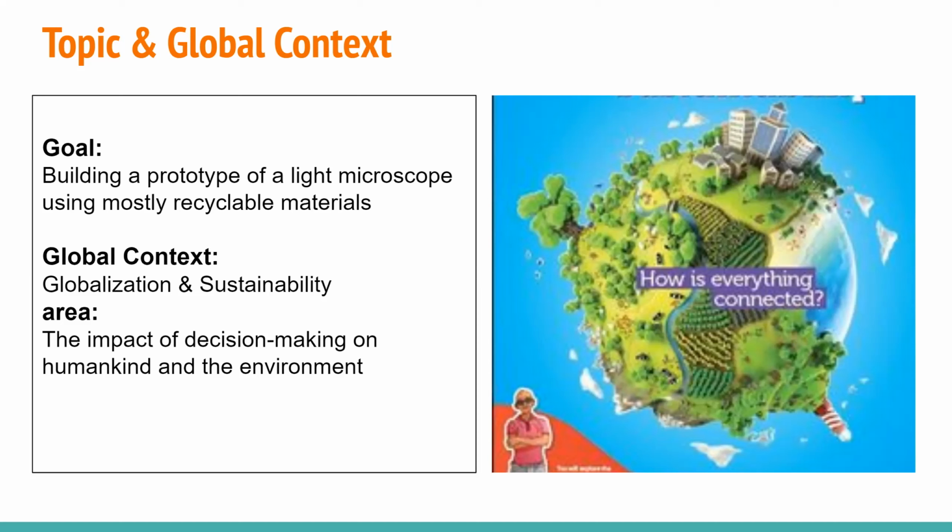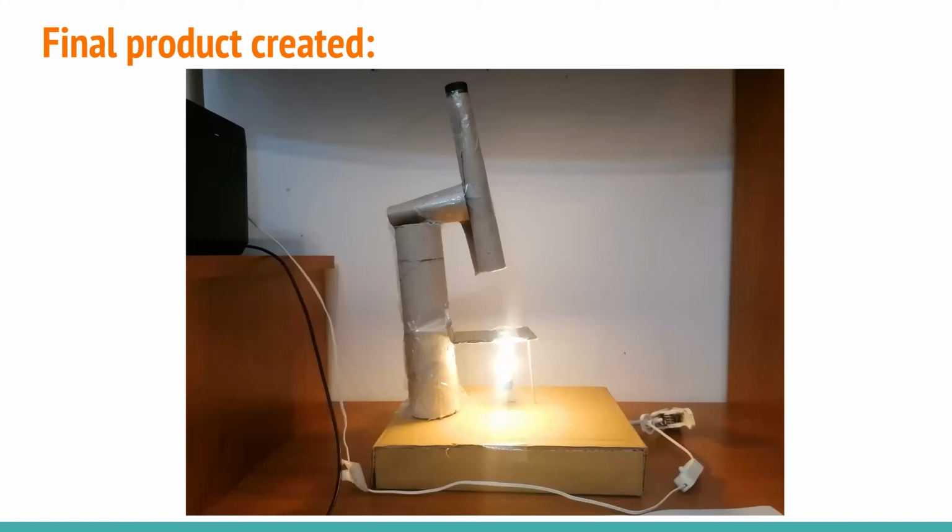I focused on this global context because I was more interested in showing people that with recyclable materials, or materials that they thought were useless, you can build a functional microscope, and this is the final product that I created.